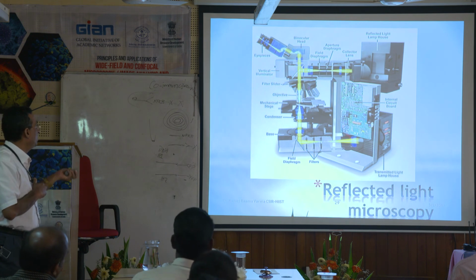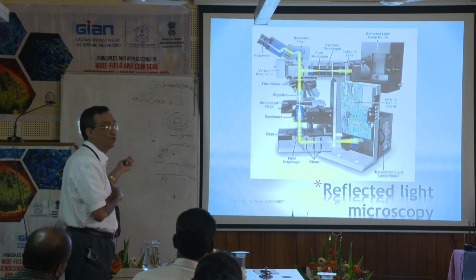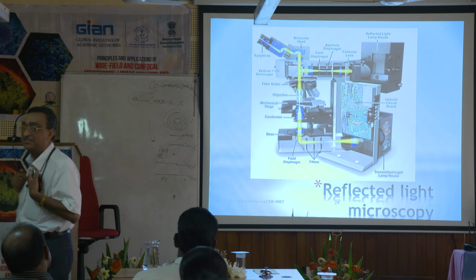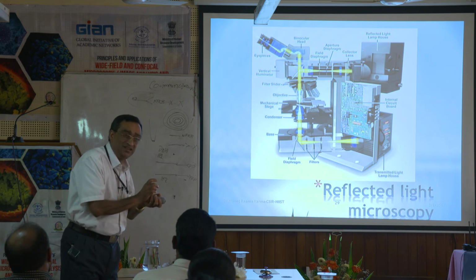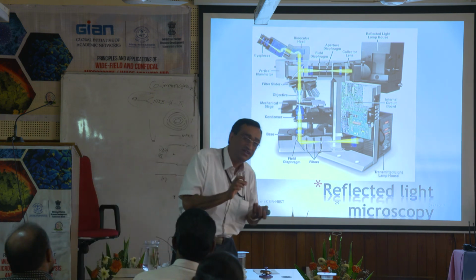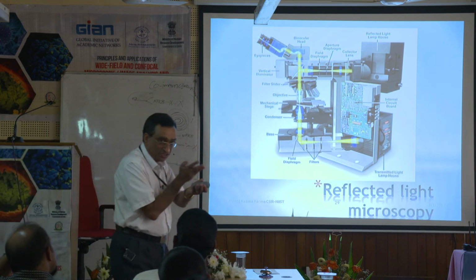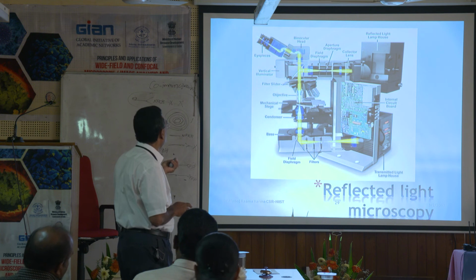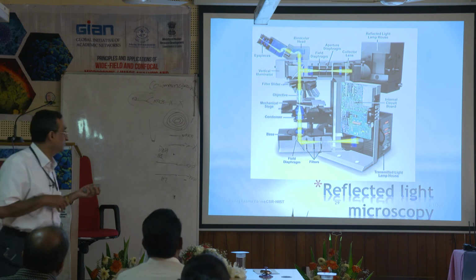Okay, and this is the general section of a microscope from top and bottom. This is for transmission mode and this is for reflection mode. Both are used. So people like me, material science people, will always use it in reflection mode because we see surfaces, nicely polish the surfaces and take the images. Whereas the people in life sciences take sections and tissues, and the light is transmitted through that and you get an amplitude contrast image. Am I right? So both can be used.